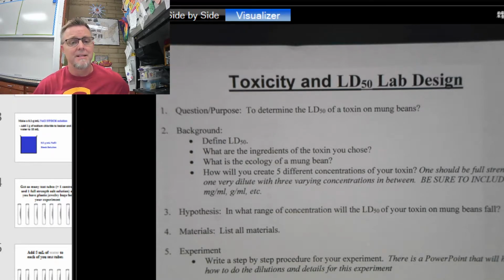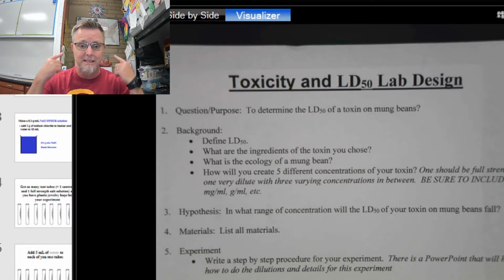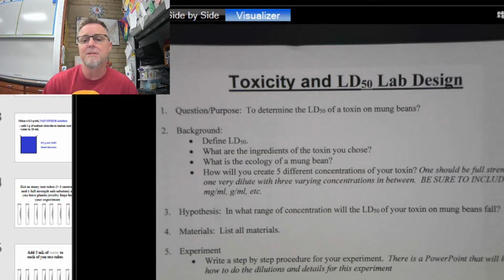Now, since you're not completing the experiment yourself, you need to pay very close attention to what you see and hear in this video so that you have all of the tools that you need in order to complete the assignment. The idea in an LD50 experiment is for you to pull off a very simple evaluation of a toxic substance, we'll call it chemical X, to determine the lethal dose for 50% of the individuals in your population.